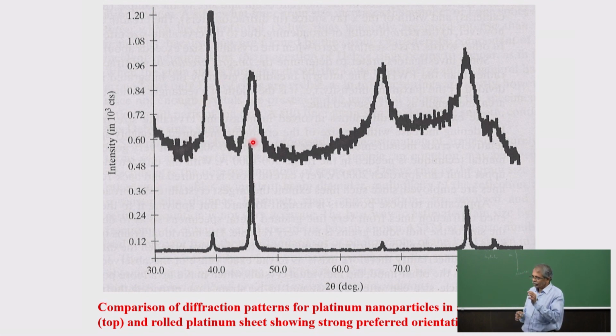In one particle, there need not be one single crystal, and it never is. It is polycrystalline, and maybe several phases or several composites are present in each. Bulk-wise, if you analyze, it will become the same ratio. But individually, structurally they are different. So you will find that.